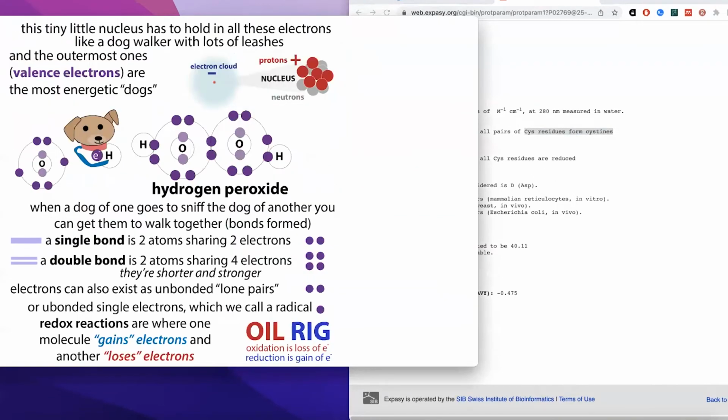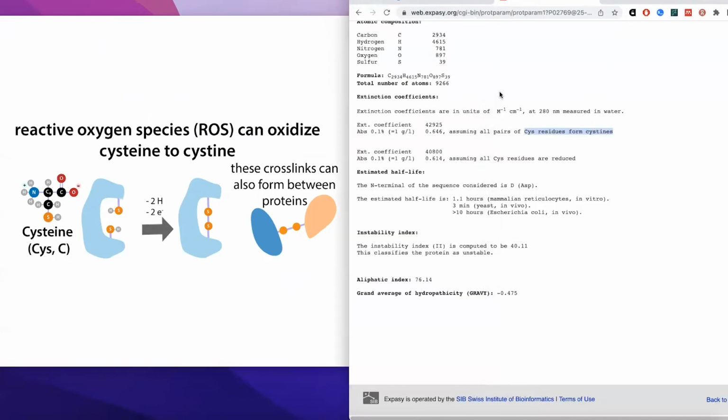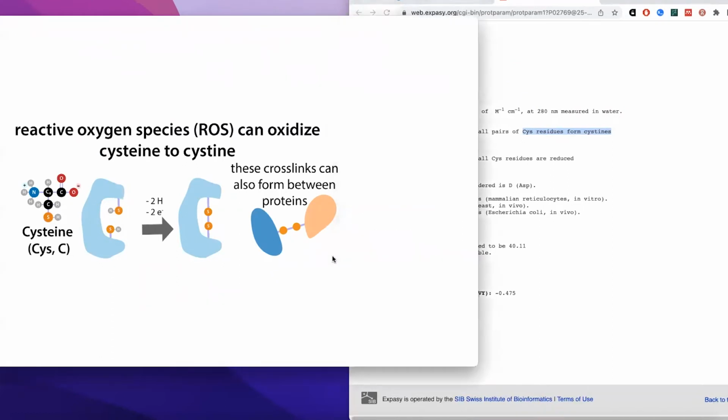So much more on this in other posts, but basically this amino acid cysteine can get oxidized and form these crosslinks, these sort of disulfide bonds. This can be helpful for proteins that are secreted and outside of the cell, like in the blood. So maybe these typically are actually in the cystine form. In BSA, I'm not exactly sure. But because it is out in the blood and stuff, and these bonds can be good for helping stabilize the protein.